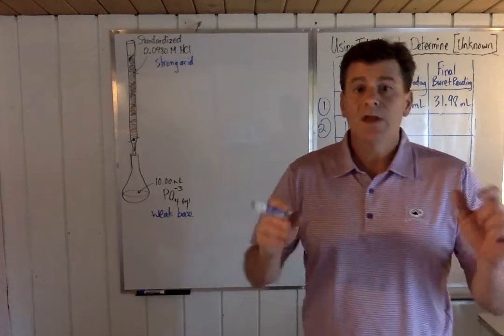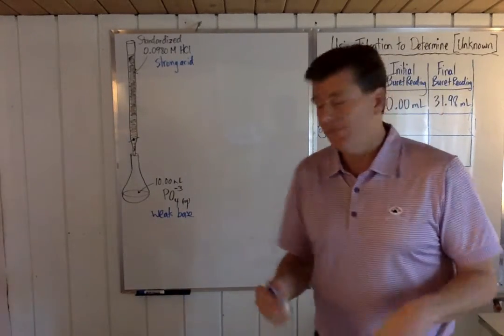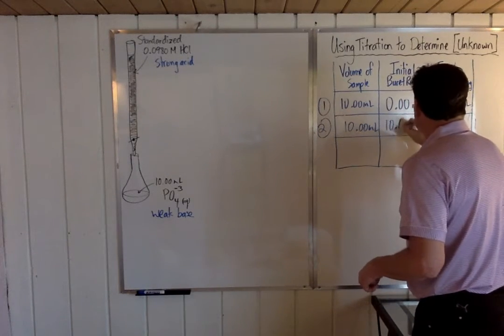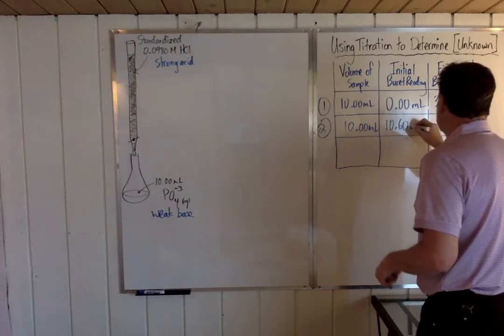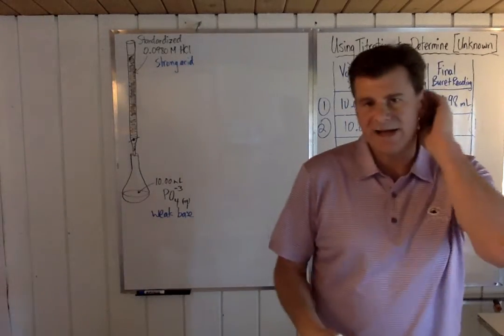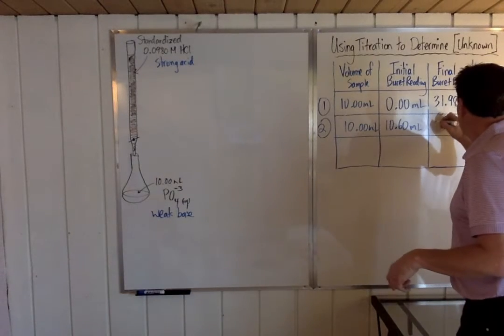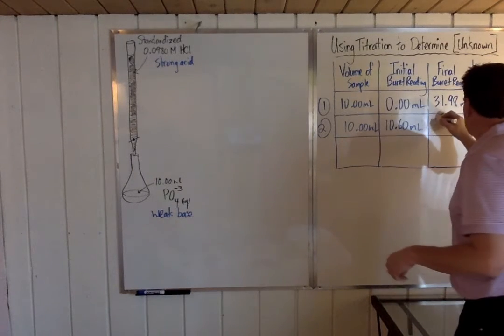Okay, but let's say you did catch that, and so you refilled it, and you started, I don't know, up here at 10.60 milliliters. And you add, and you add, and you add, and you go down to, what would that end up being?